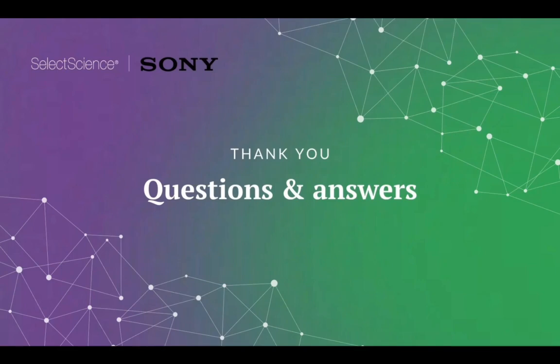Great, thank you. And can multiple users in the lab share an SFA license? Yes, so when you get an SFA license, you can have up to 5 logins for each license. So if there's multiple users in their lab, they can each have their own individual logins.